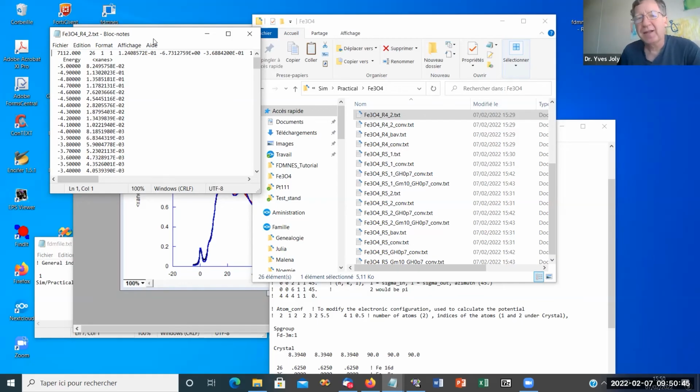Now, how? Suppose, for example, that you have a reference sample, which could be metallic, and you have measured it, and you did also the experiment on some oxide, the same element in some oxide, for example 2 plus, another one 3 plus in another compound. We know that this gives a shift in the experiment of the main edge.